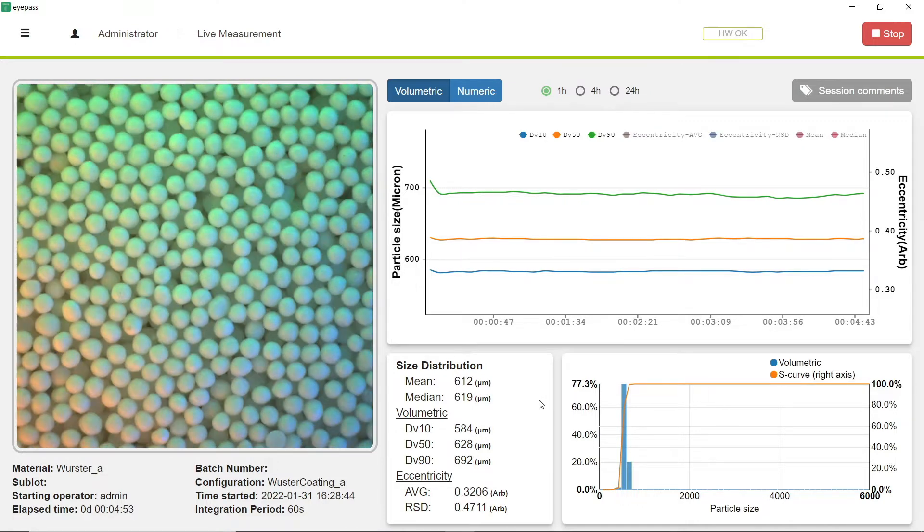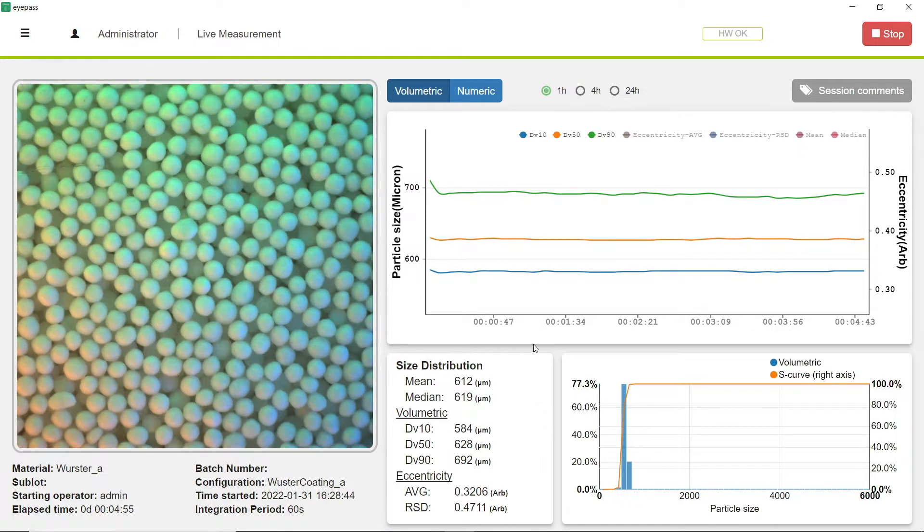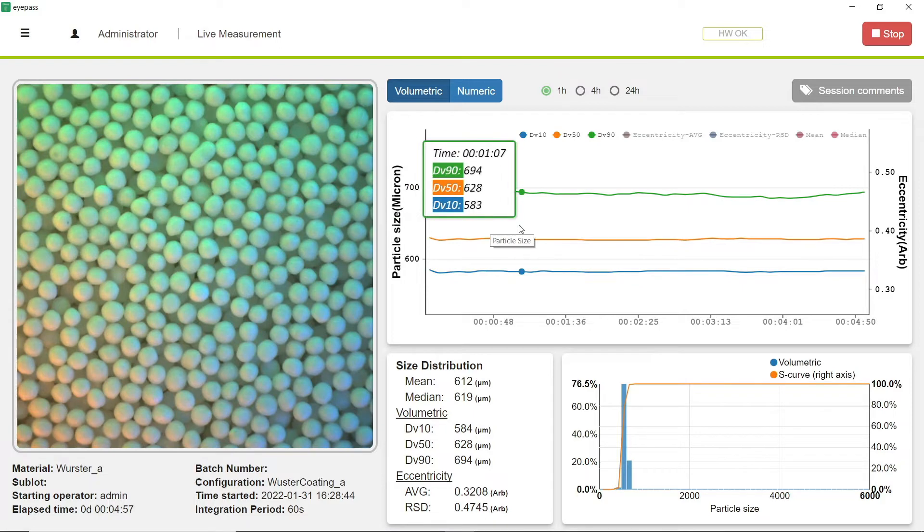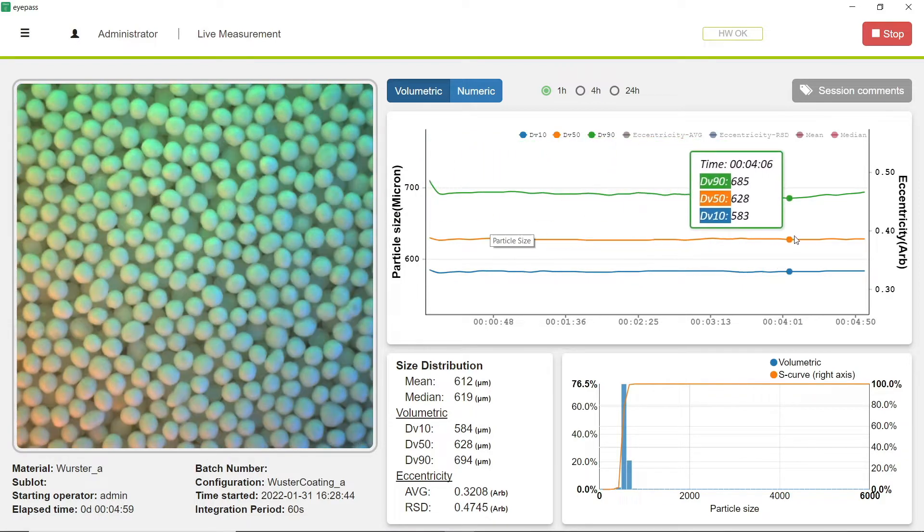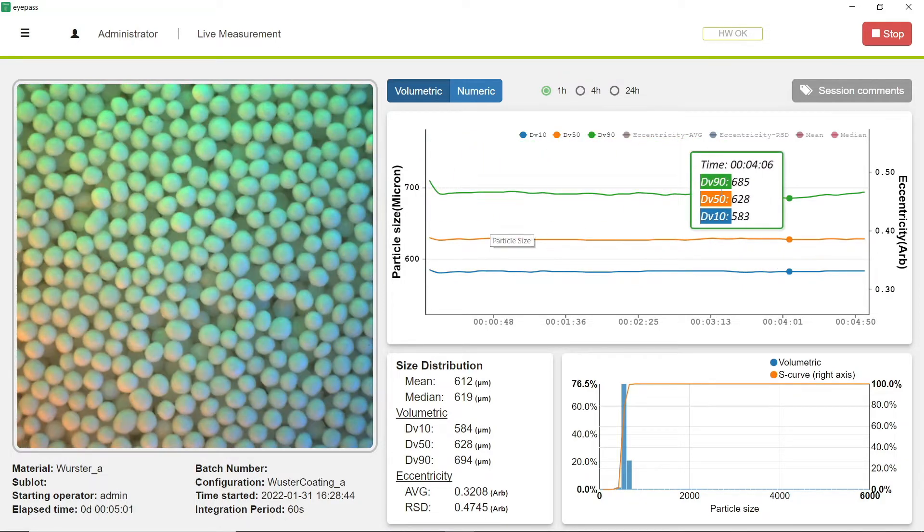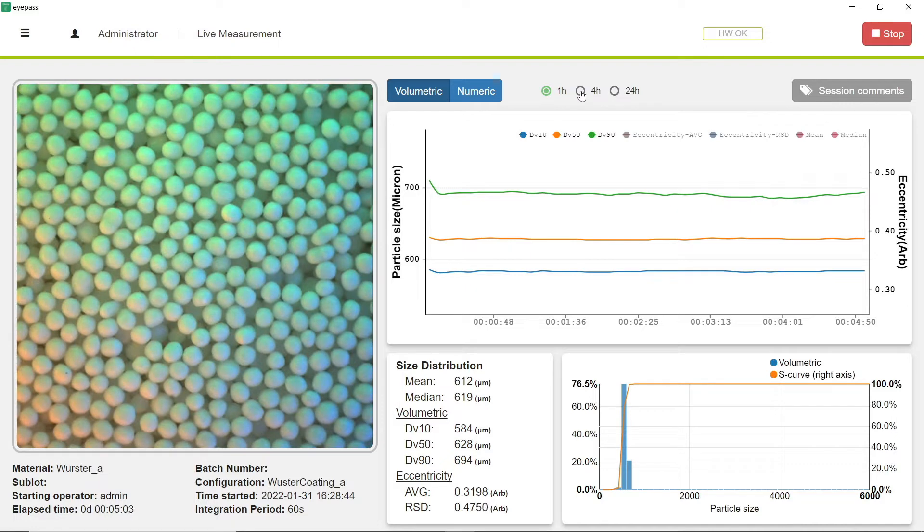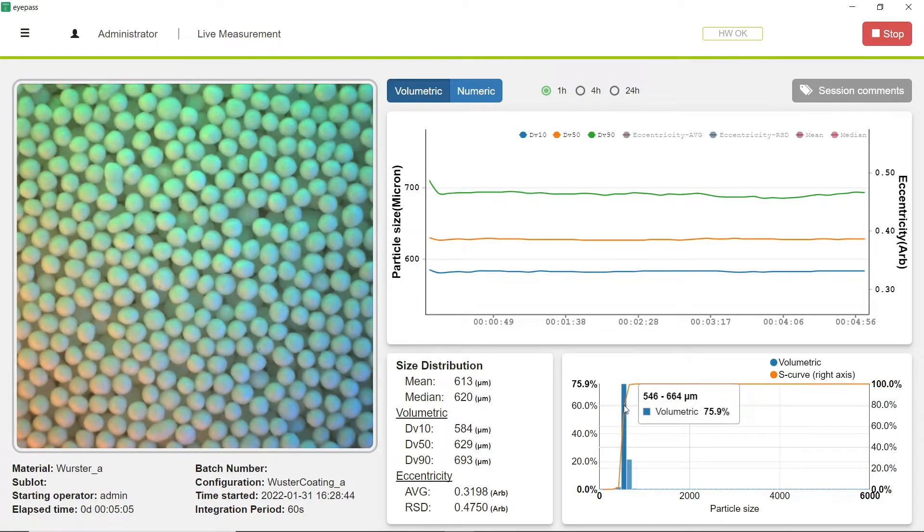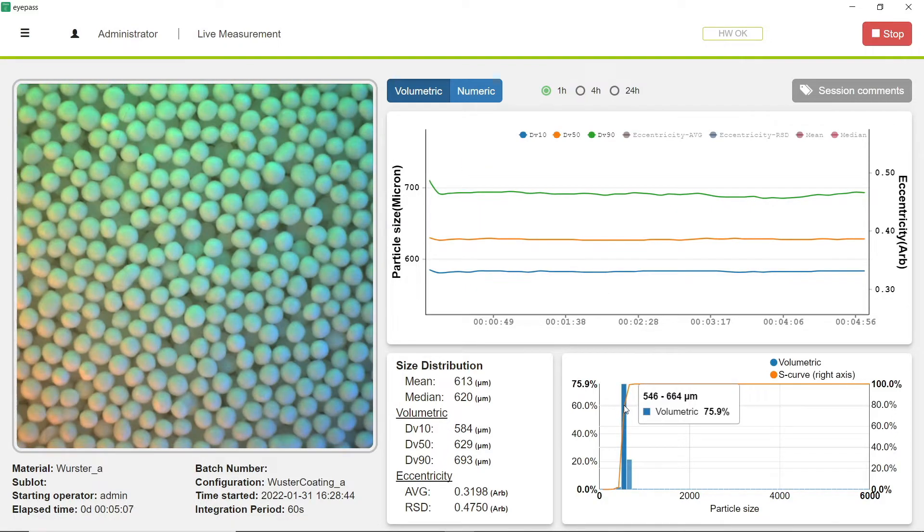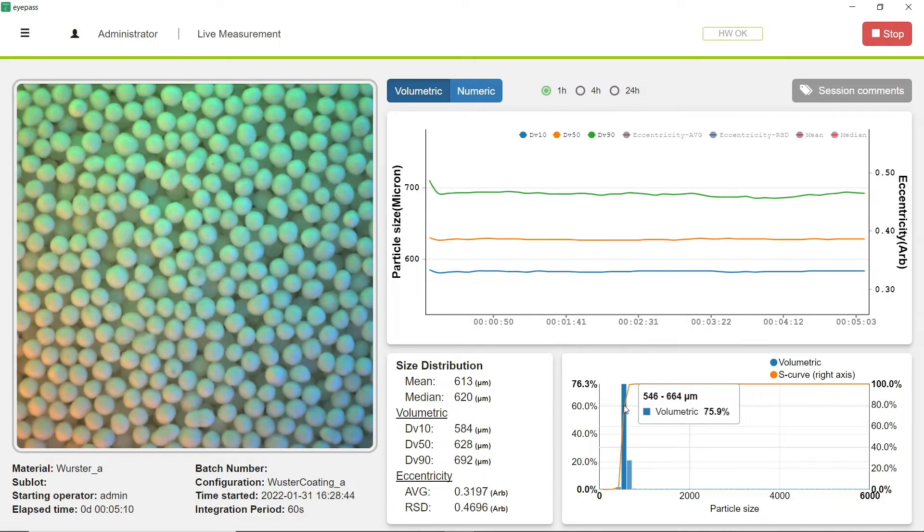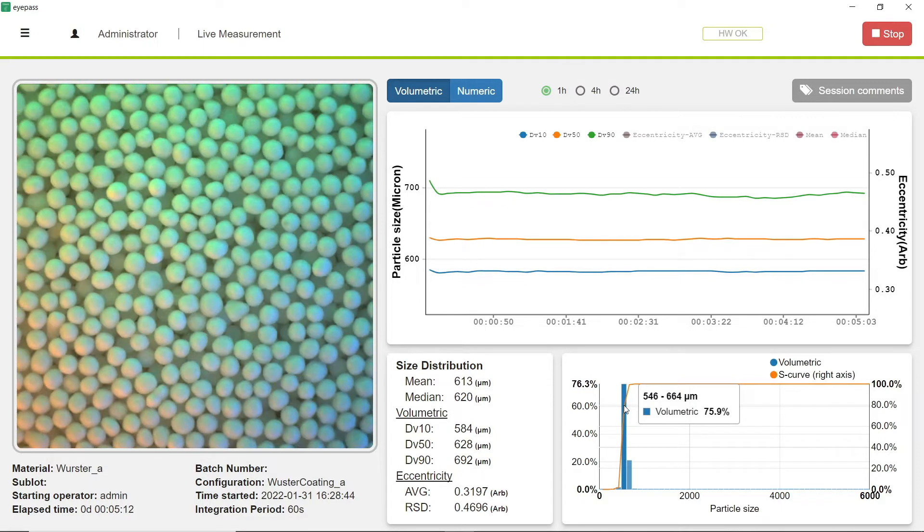We can also hover over these charts here to get more information about what's happening in our process inline, and we can zoom in and out of that data. We have the histograms here on the bottom which we can hover over to tell us what kind of brackets the material is falling into, so we can say that 75% of the material we've measured is falling between 546 and 664 microns.